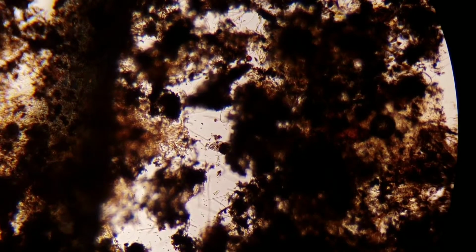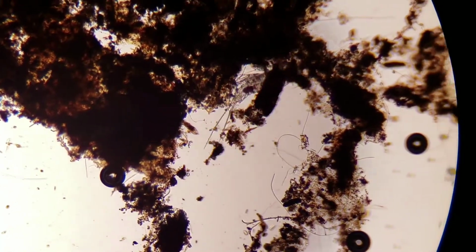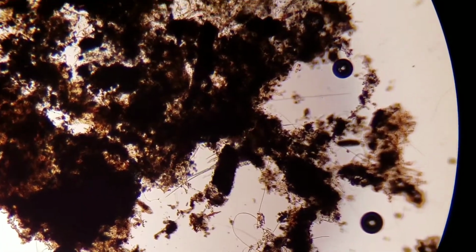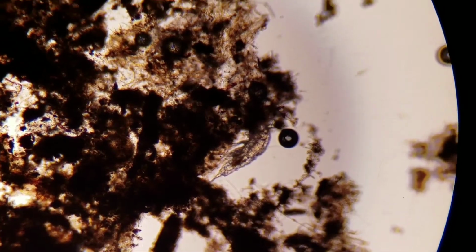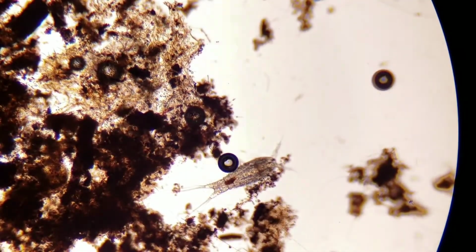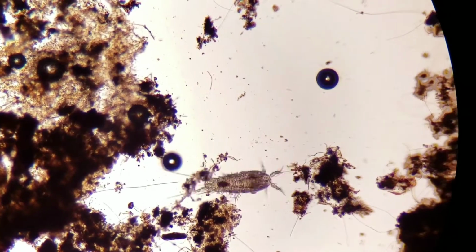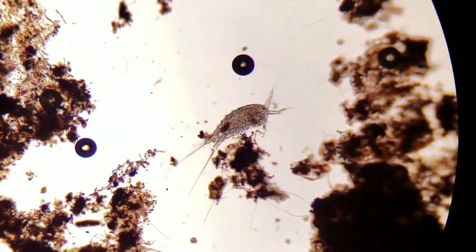We'll check those little... Something moving back there. Check these little channels here. Zoom in that one. There's a full-grown copepod. Come on out, buddy. Show us your red eye. And he's got a poop in him, too. See if we can brighten it up a little. Maybe after I give you the next slide, I'll give you a dark field slide. See the difference on that. Bet you we're going to see him poop very soon.